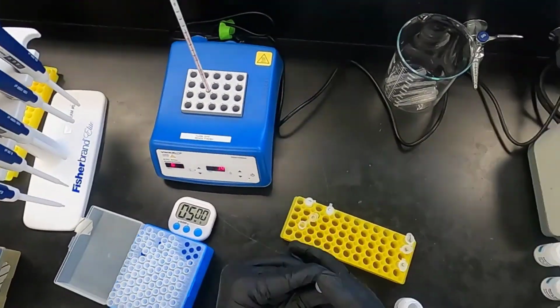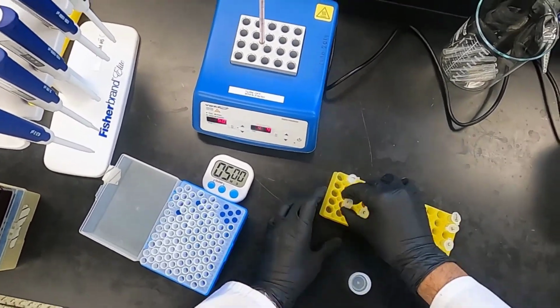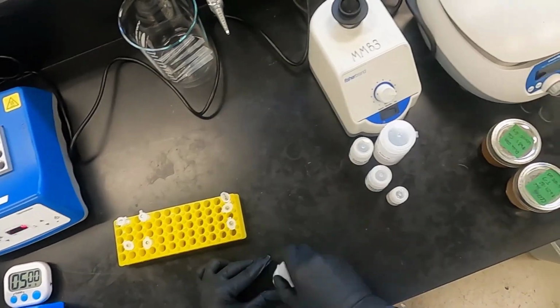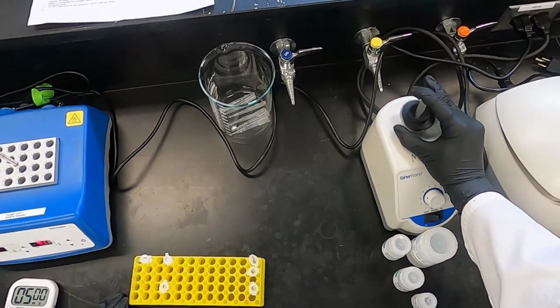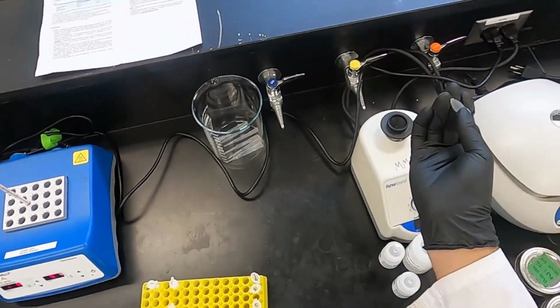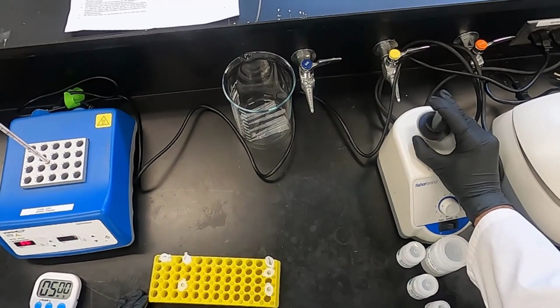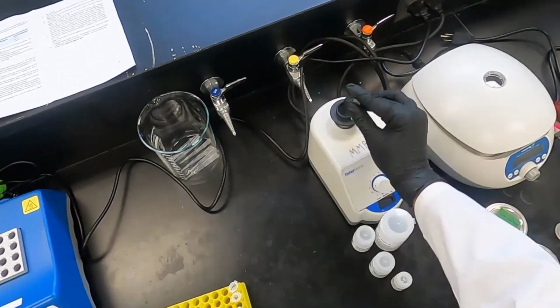It is important that they are homogenized, so we're going to use a vortex to homogenize them together. You're going to want to vortex these and make sure that they're properly mixed, so shake them up and down, vortex again. And now the other sample.